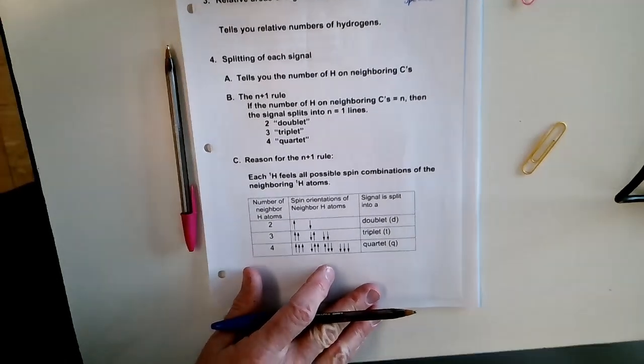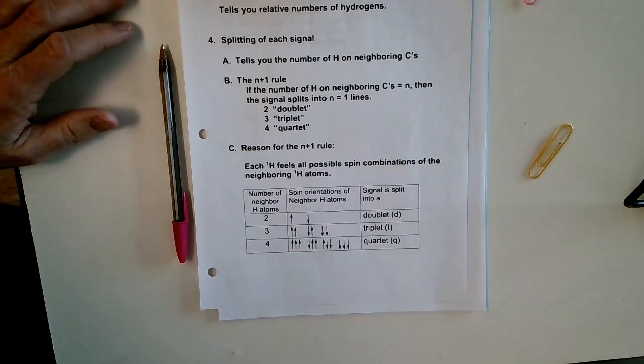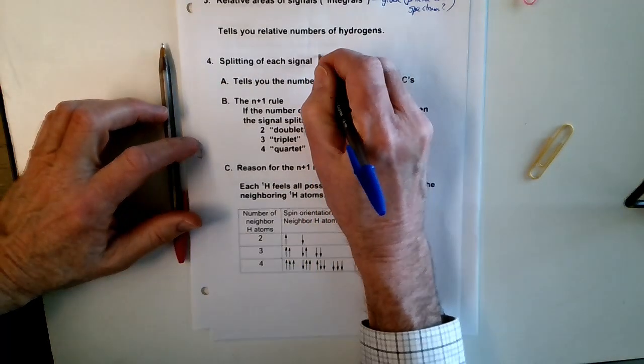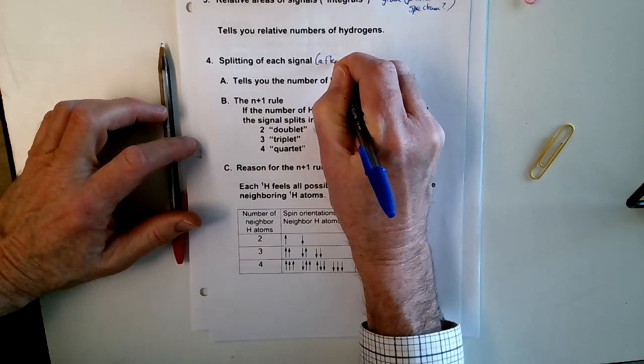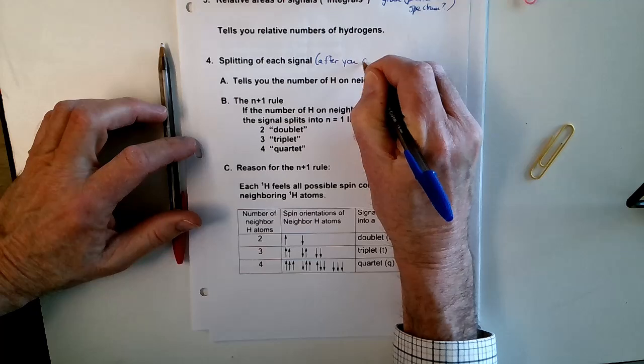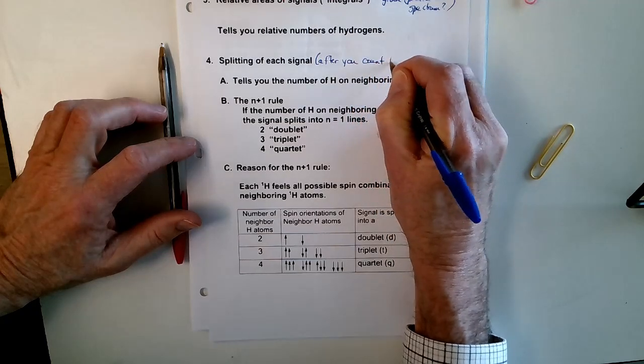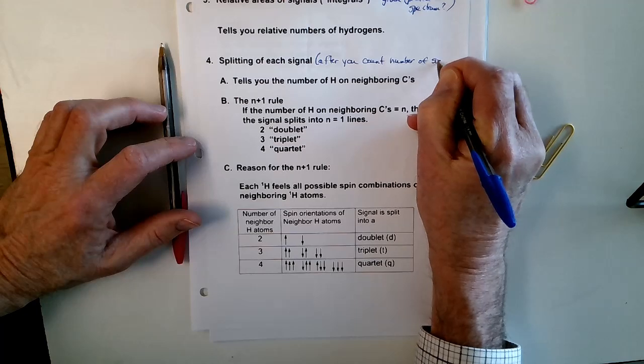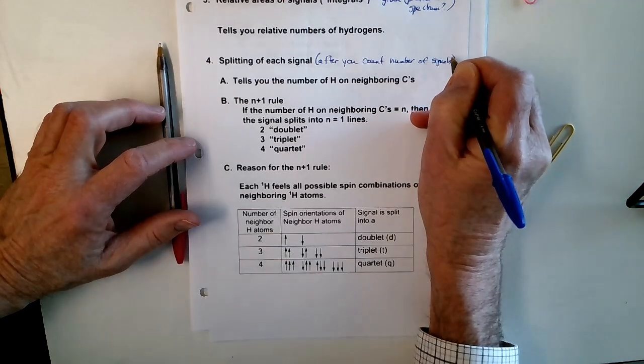And then here's the next one. The splitting of each signal. Now we've counted them up. I'm going to say this is after you count the number of signals. Then it turns out that each one of those signals can be split.